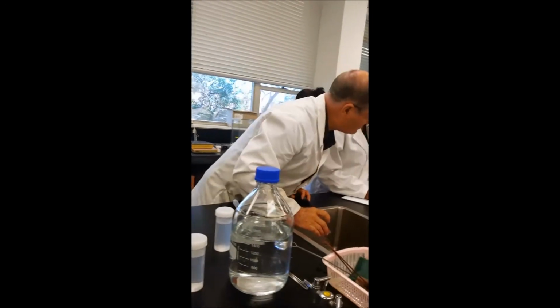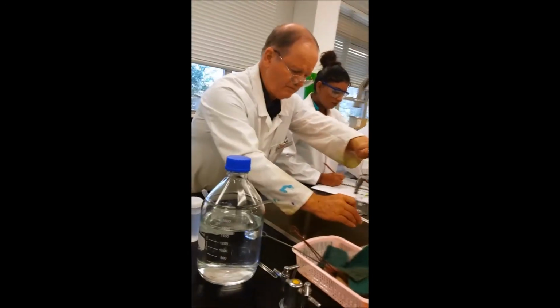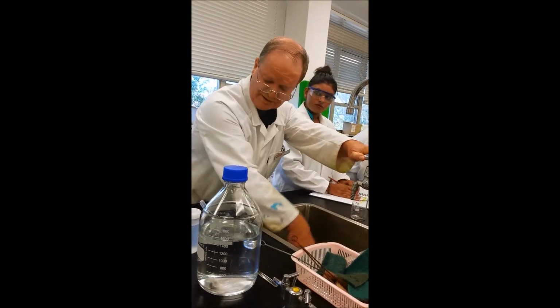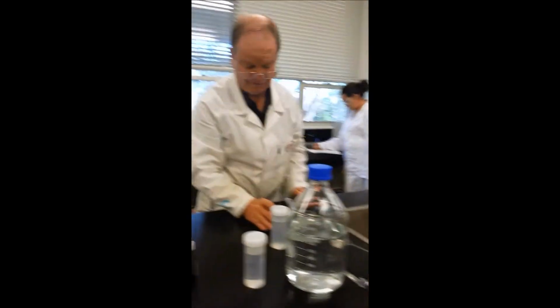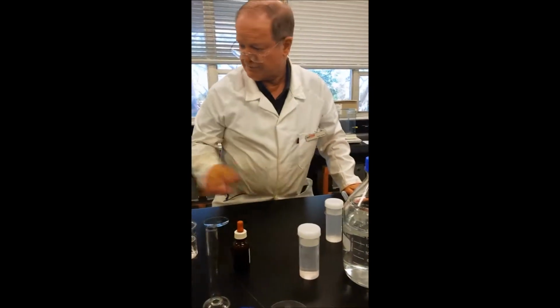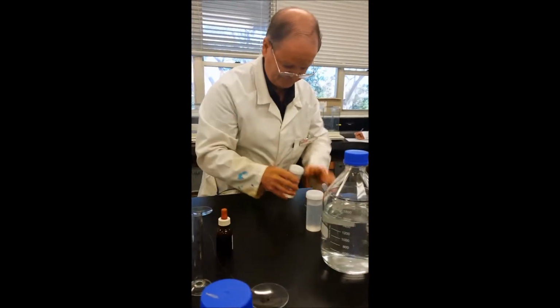Now, okay, so you actually have to test the ones that you make, and you do this. We'll do this today and every week. So they're up. So rinse out that one. And you need to use one. And the next one is going to be the phenolphthalein.